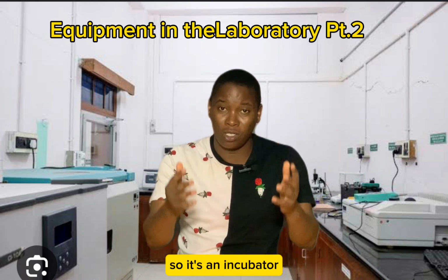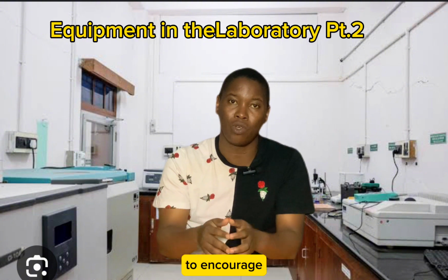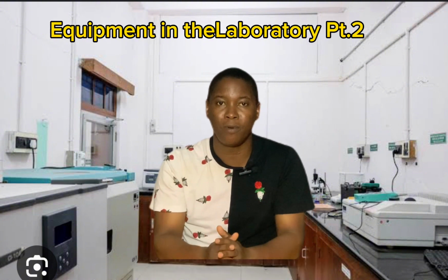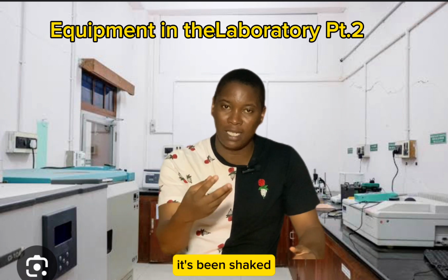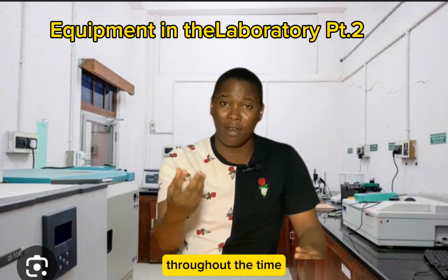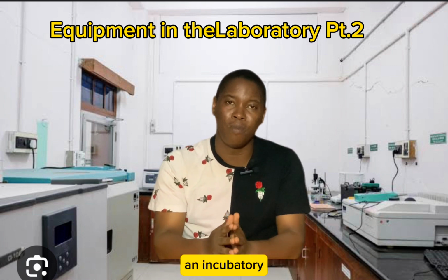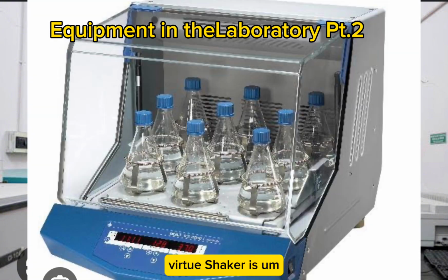So it's an incubator, like I've earlier discussed incubators, where you can keep samples to encourage microbial growth. It will keep the sample at a particular temperature and humidity. And then that sample is being rotated, is being shaken, is being homogenized throughout the time that it is within this equipment. We call that equipment an incubatory shaker. Some people call it a rotatory incubator, but incubatory shaker is a very well-known term.